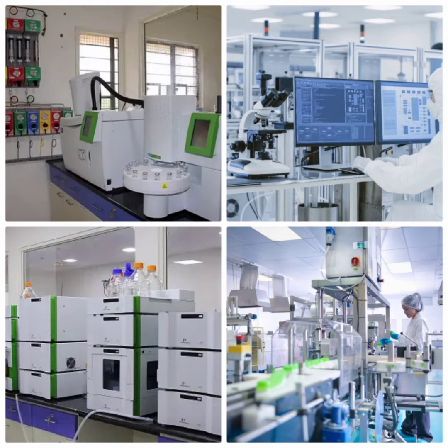So we are going to compare the two techniques based on cost of operation. Generally, HPLC solvents are costly in comparison to gases used for GC analysis. In addition to cost of solvent, the maintenance cost of high-performance liquid chromatography systems is also higher due to higher pressures developed in pumps and columns. GC analysis in comparison is less costly and has lesser maintenance cost.